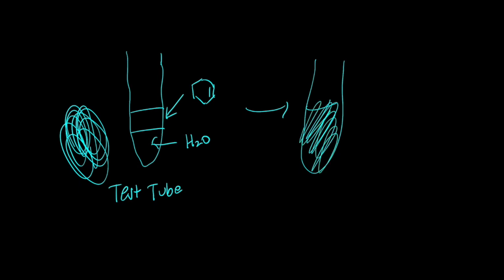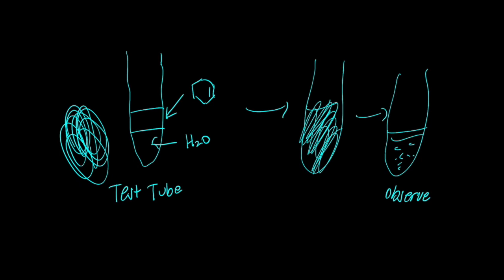It's gonna look all cloudy. And then we're gonna see maybe some layers separate, maybe some brown precipitate, maybe the color change and all of that. So you wanna observe at the very end, okay? So I hope that makes sense. And so we really have to shake it a lot to get these 2 reactants, which, remember, the potassium permanganate is ionic, it's soluble in the water, so these phases need to kind of mix up a little bit, all right?